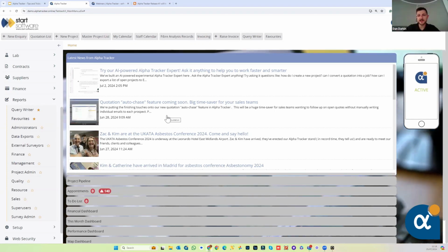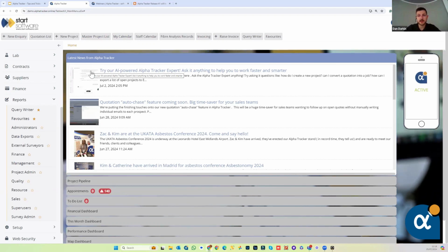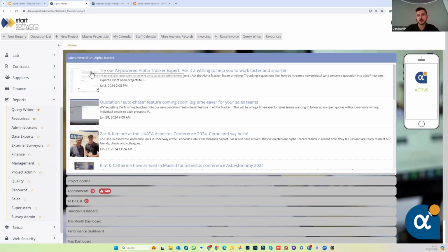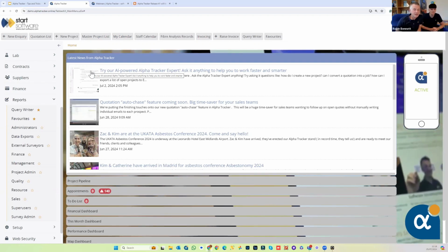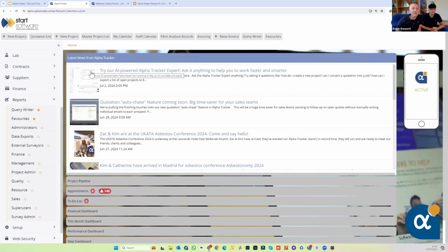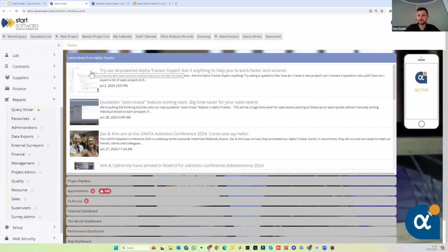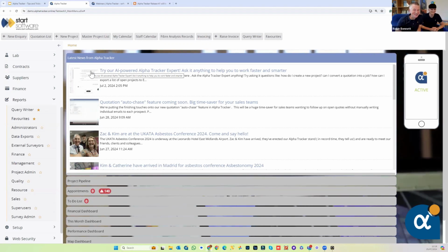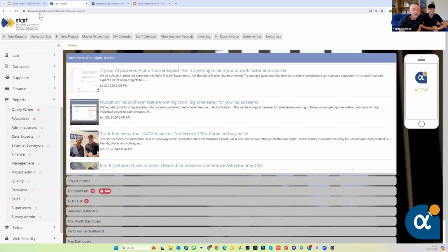Great, fantastic. And then we've just got one other one, from Debbie. Can super users move reports to different folders for access? Yes, they can. You can just change the group that the report's in. Fantastic. Good questions. We like these questions. These are really good.